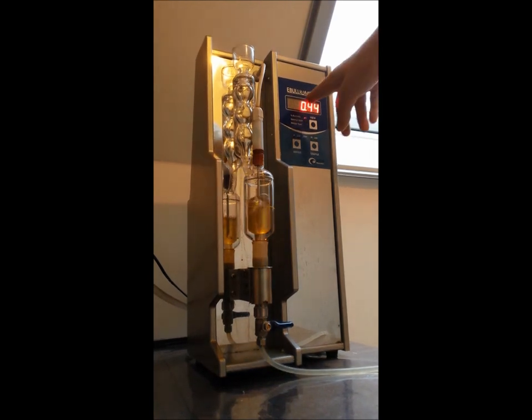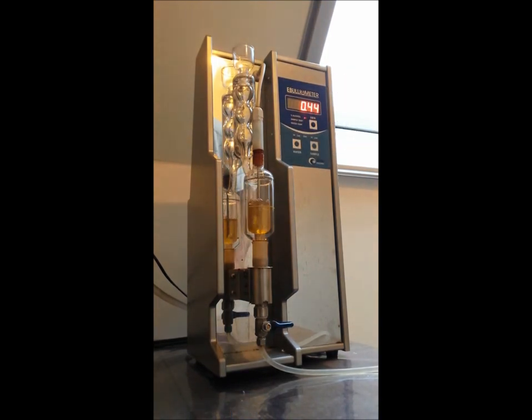The result now automatically displayed is 0.44, indeed a slight increase versus the previous result as expected. And the final boiling temperature is 99.86. We will do that measurement once again to check the stability of our results.